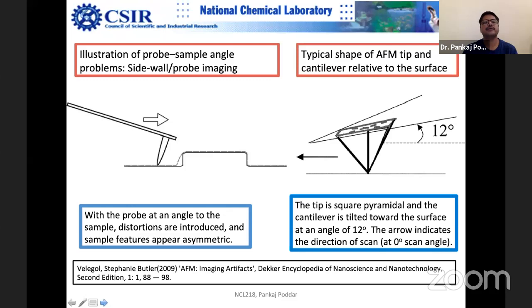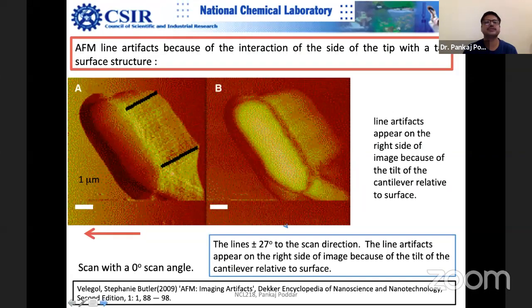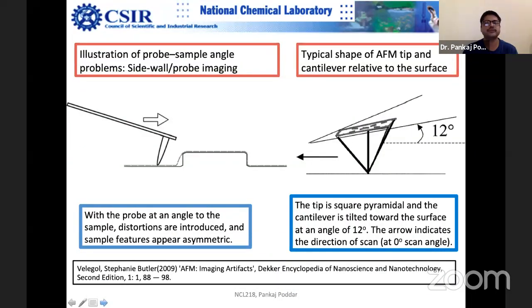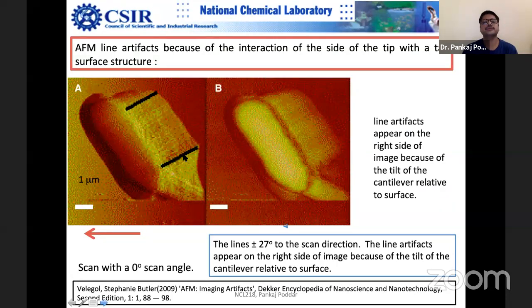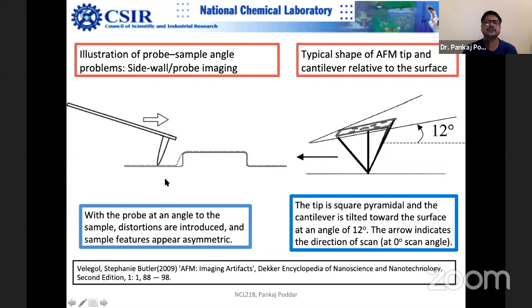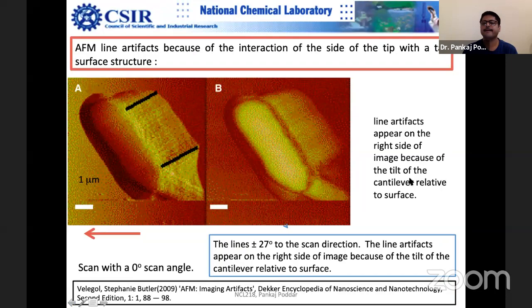AFM line artifacts occur because of the interaction of the sidewall of the tip with tall surface structures. You can see a shadow-like feature at the side of certain surface objects — this is because of sidewall interaction and is quite common. In many AFM labs, you also have a test pattern used for calibration and checking tip readiness. It has pits and other features. You can see that the pits are slanted at a certain angle when they should be rectangular — this is another problem because of the vertical sidewall.